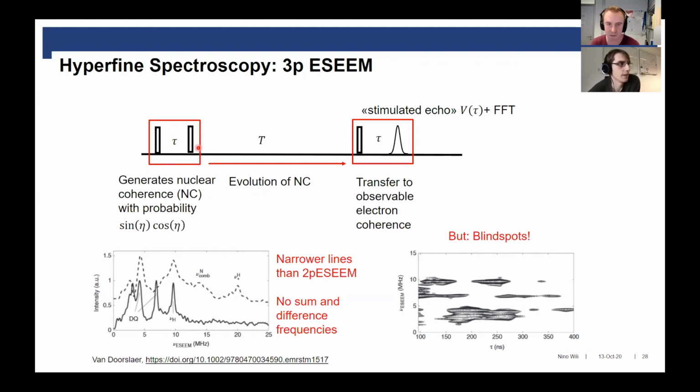Okay, yes. So another anonymous attendee asks, are the hyperfine experiments tolerant towards the pulse flip angle? How well do you have to set that? Well, in general, if you put a pulse into the center of your spectrum and you excite only a very small fraction of it, then the flip angles will be bad for most of the spin packets that you have. But it's not so much an issue here because you just do phase cycling, basically.